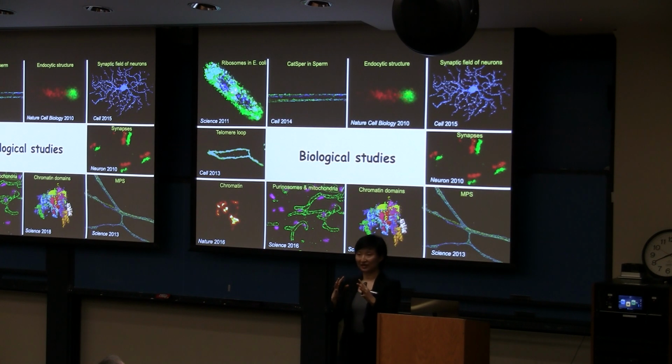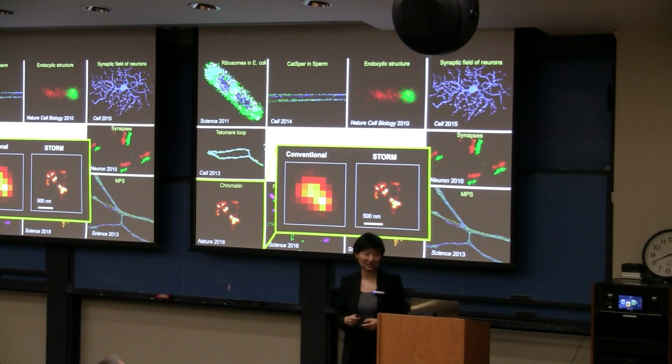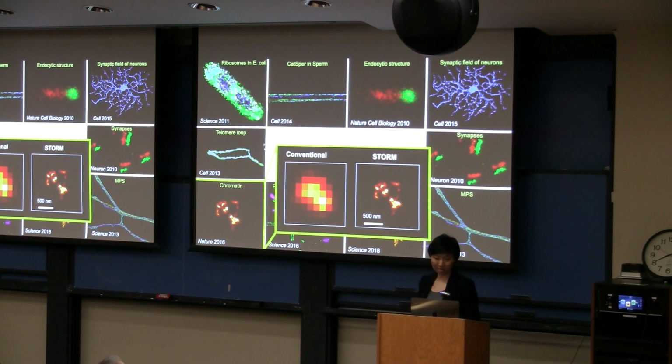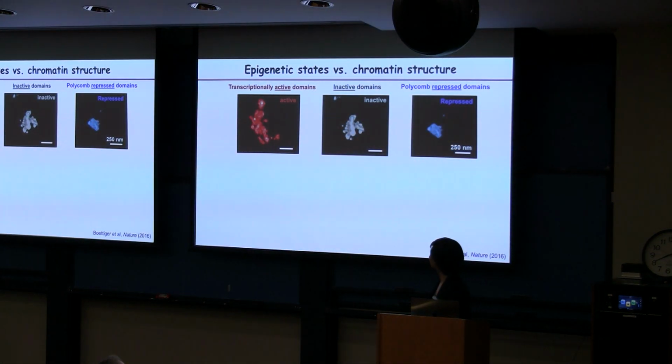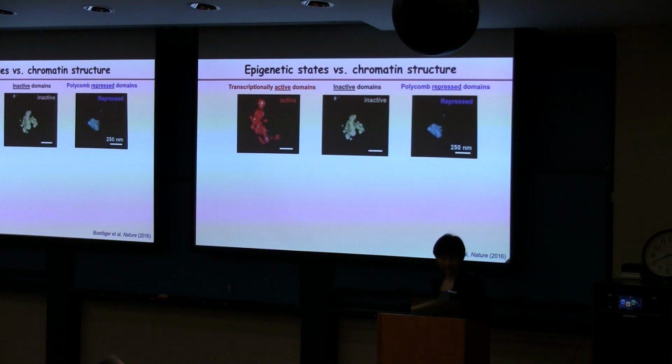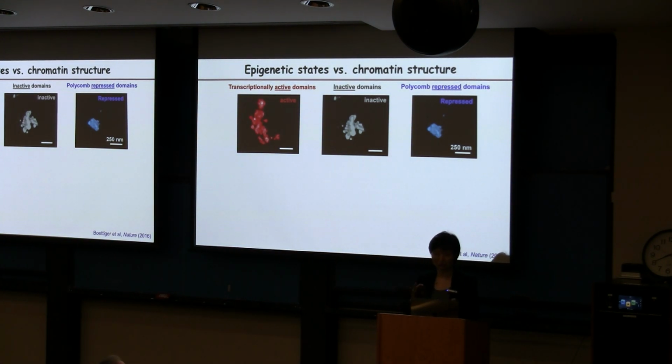And we can look not only at structures in the cytoplasm, but also at the nucleus, which compartmentalizes our genetic material, and look at how DNA is folded in the nucleus. Maybe I'll expand on that a little bit: it's interesting because you can think about the DNA as a physical system, a polymer that's folded up into a three-dimensional structure, and this three-dimensional structure is very important for its function.